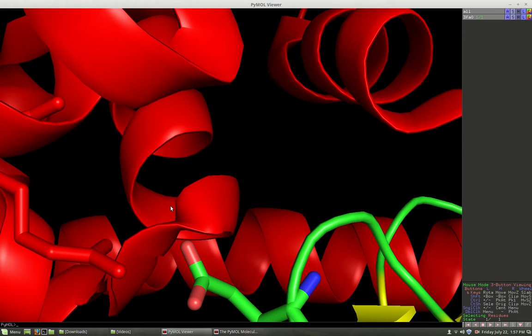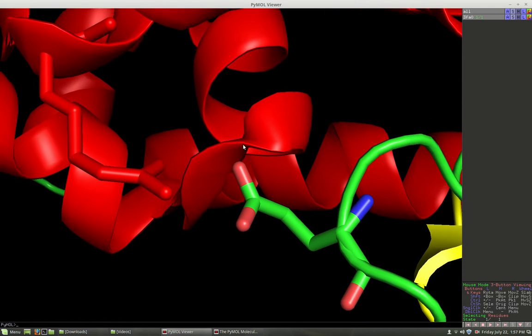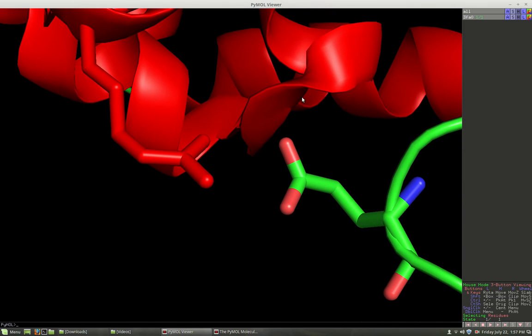All right, I'm going to use the second one, move this direction, move it up a little maybe. Second one again, rotate it a little more, move it up. There we go. That looks pretty good. Now, at this point, we could do what we did before, and we could look at bond angles. So let's do that just for fun.